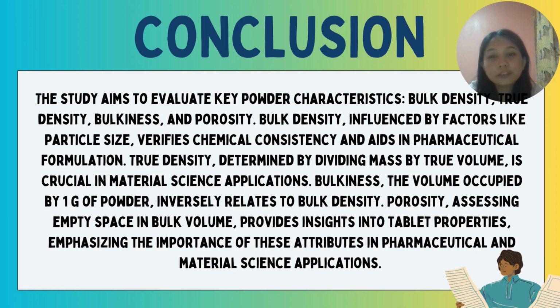Now for our conclusion, the study aims to evaluate key powder characteristics: bulk density, true density, bulkiness, and porosity. Bulk density, influenced by factors like particle size, verifies chemical consistency and aids in pharmaceutical formulation. True density, determined by dividing mass by true volume, is crucial in material science application.